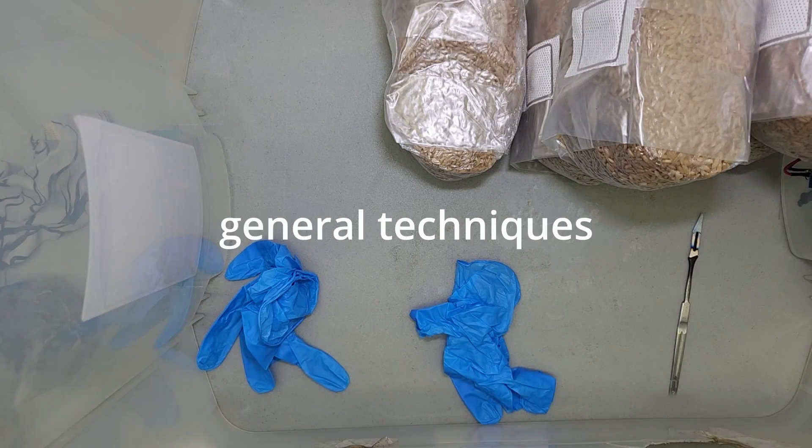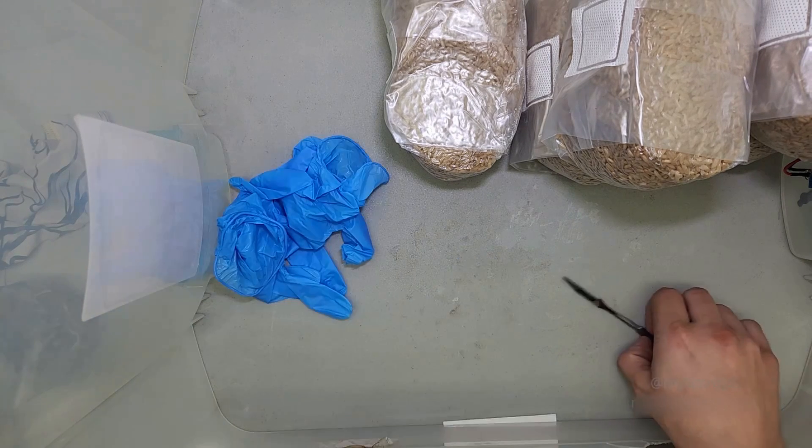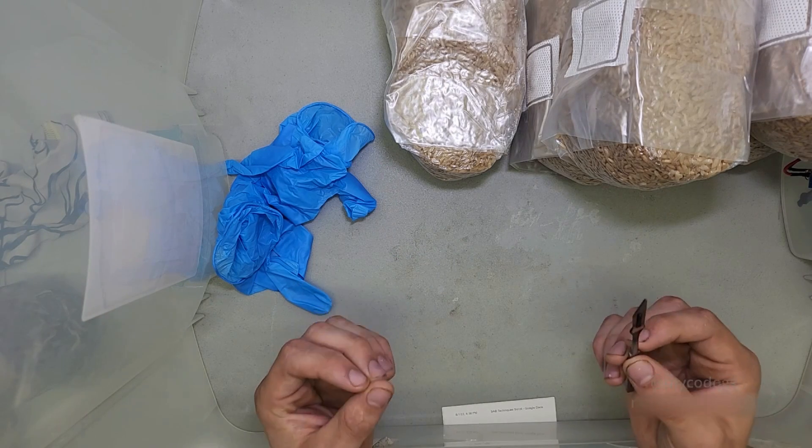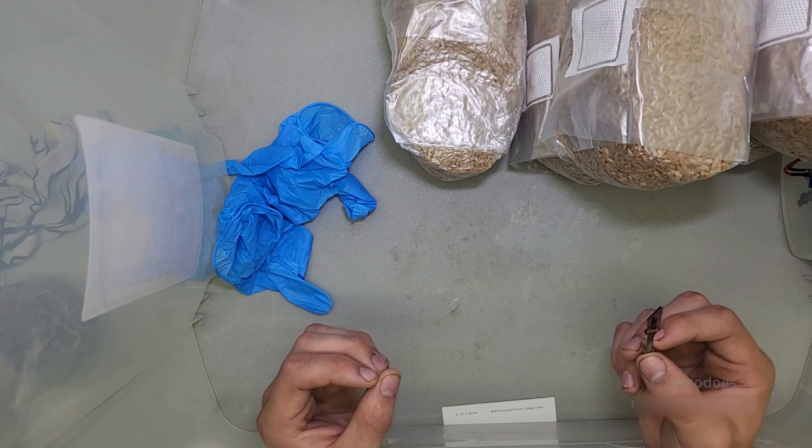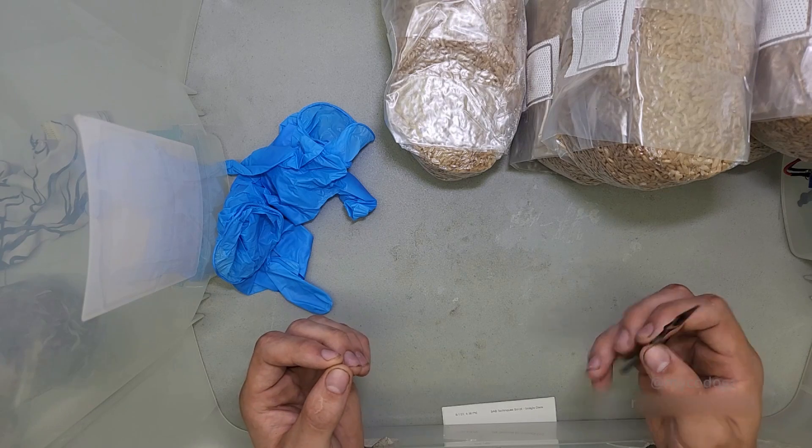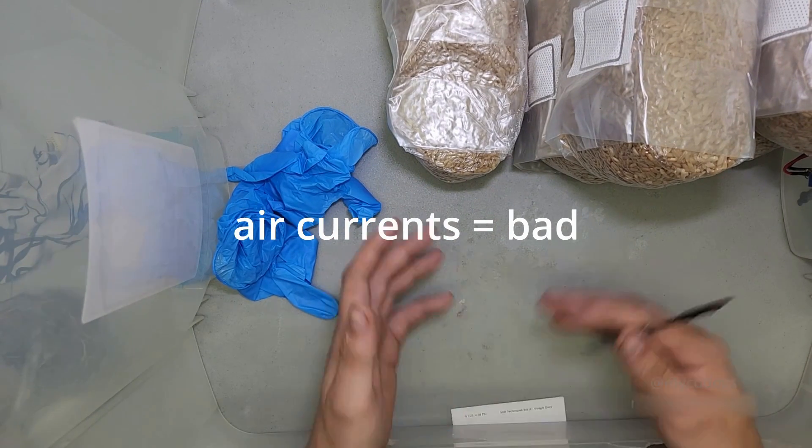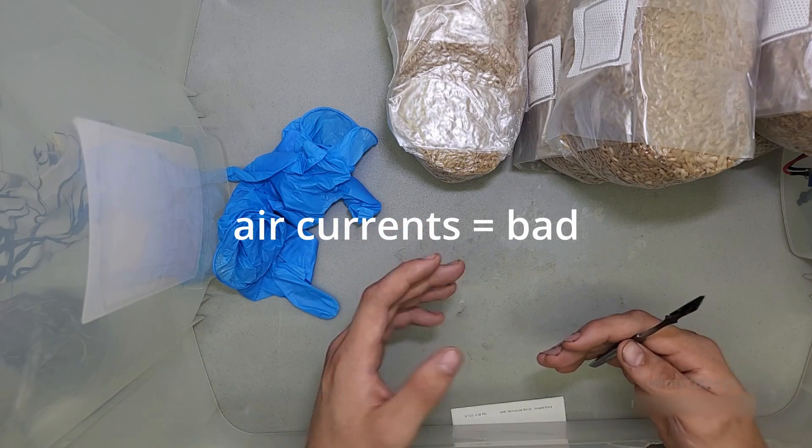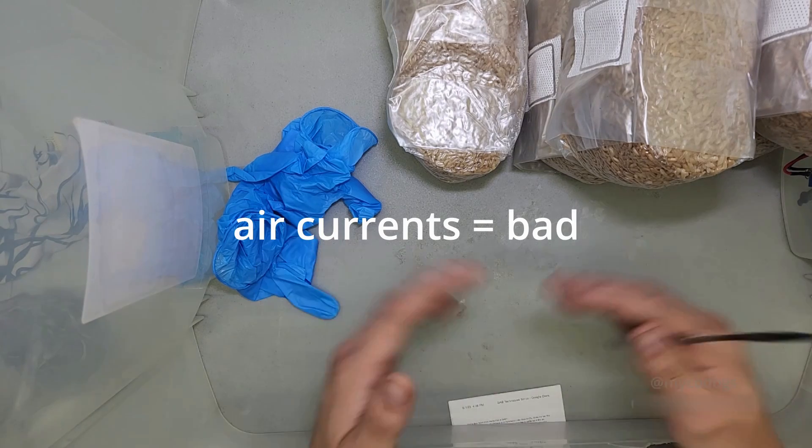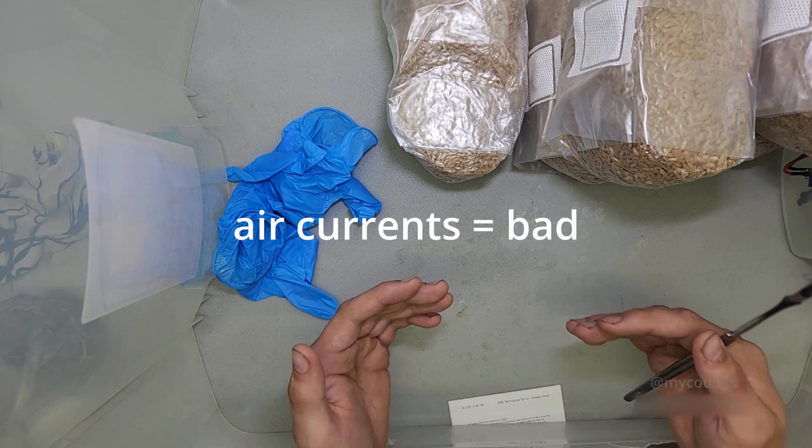All right guys I just want to talk to you about some general techniques when using a still air box now. Imagine I'm working within this still air box. There are a few different things that I like to stay conscious of to make sure that my work stays sterile. So the first and arguably the most important thing to be aware of is don't be waving your hand all around in there. Don't be coughing inside of the holes. If you're smoking when you're doing this turn your head away at least. You don't want to be creating air currents inside of your still air box because that will defeat the purpose of the still air box.